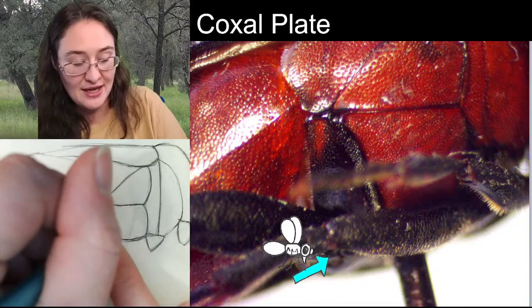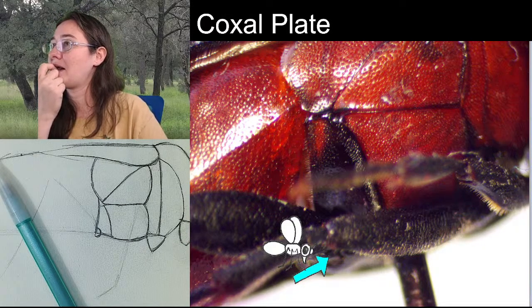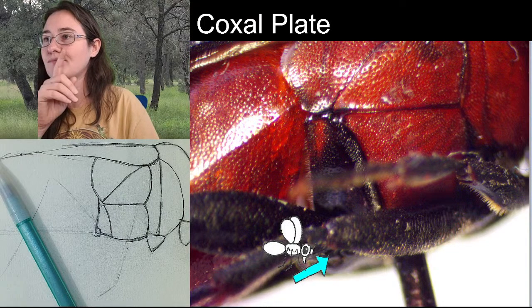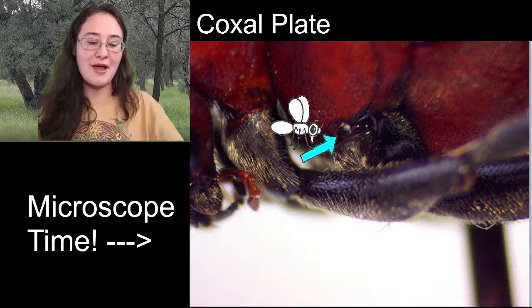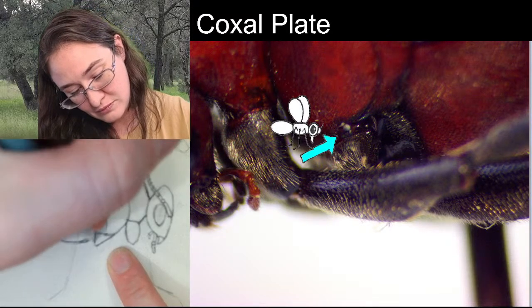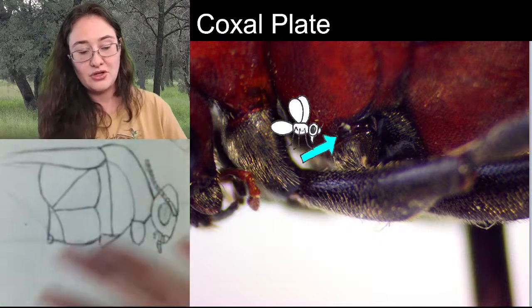So if we were going to add the connection to the leg, it would likely be right around there. So we can't really see the second coxa, can we? Not really. Let's look on the other side, see if we can see it. Well, it's right here. So it might be laying a little bit closer to the body. More like this. And then the leg connects to the bottom of that. So the leg would be connecting right here.